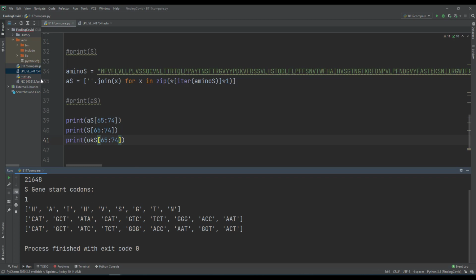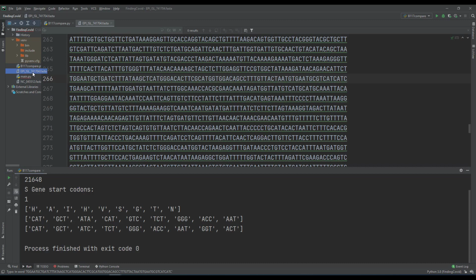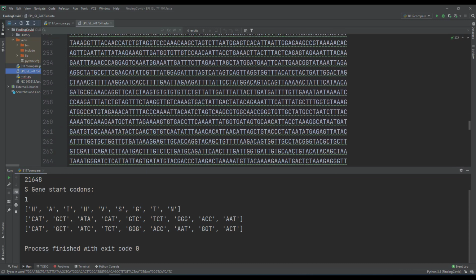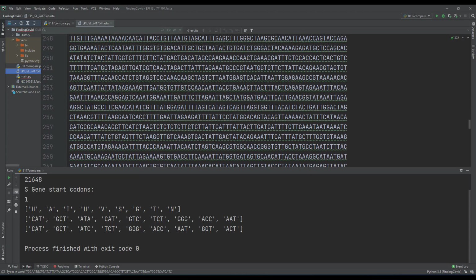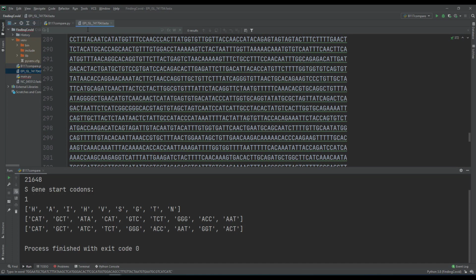Let's go over to this left hand side over here where it says the GISAID file, and I do apologize, I said that wrong in the beginning of this video. They did a great job, minus only giving access to people with collegiate email addresses. They're doing a great job.